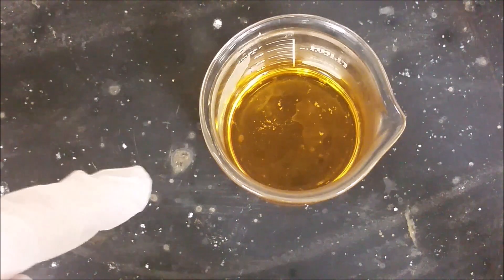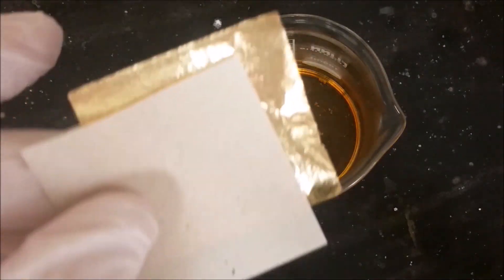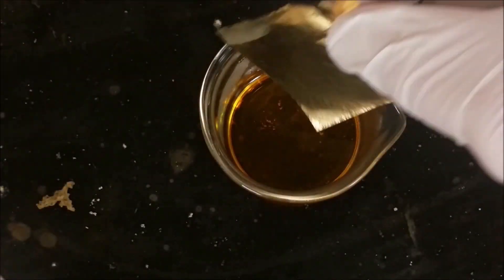So this is the aqua regia after one piece of the gold foil has been dissolved in there. We're going to go ahead and take a second piece and put that in there so we can see it from a different angle without some of the obscurity.